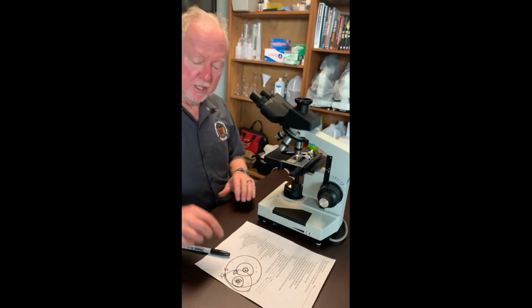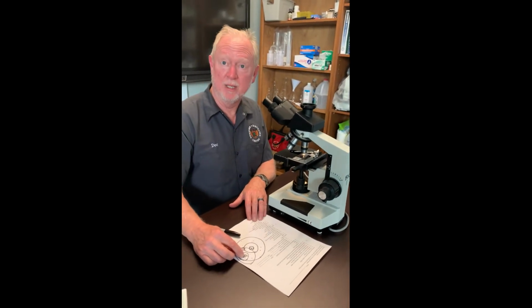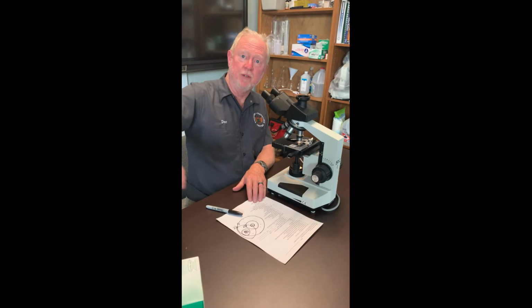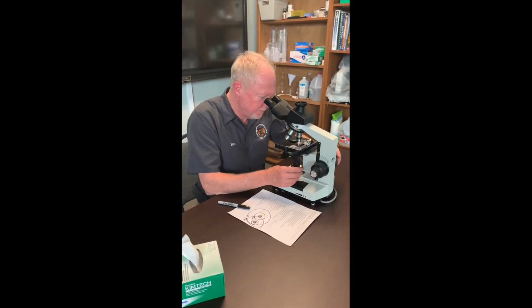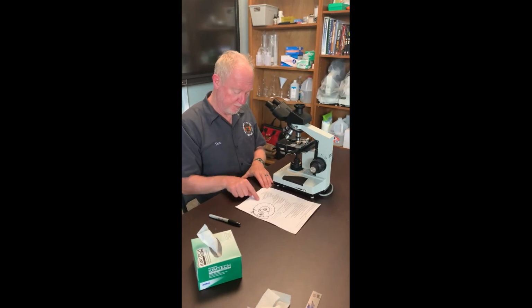So that's another reason that you might not be able to get into focus, because it's now out of your field of vision. So move it to the center every time you go up in power. Okay, what else are we going to talk about?